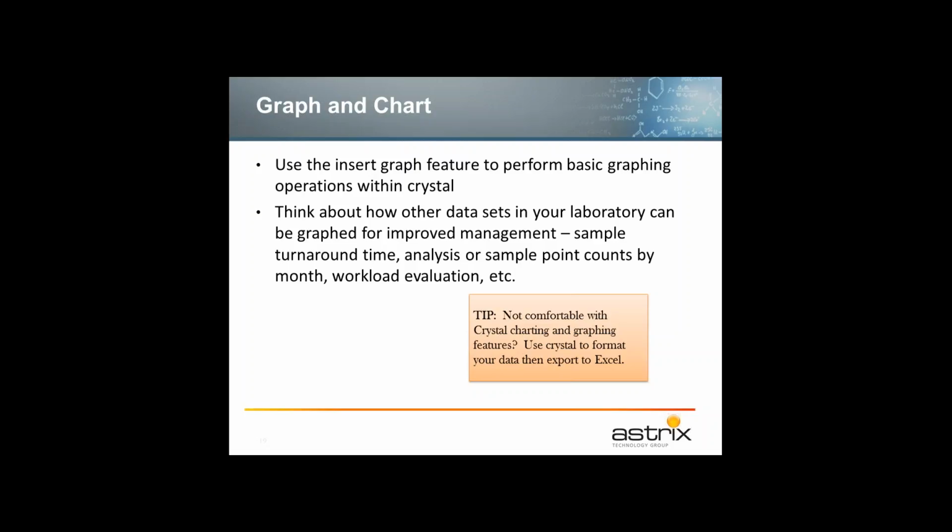And then a tip I put here really has nothing to do with Crystal, but a lot of people are not comfortable with the Crystal charting and graphing features, but they're really comfortable with charting in Excel. If you want to go that route, use Crystal to export the data and format it in a manner that can be easily exported to Excel, such that your Excel charting functions can pick up the data that you're exporting from Crystal.